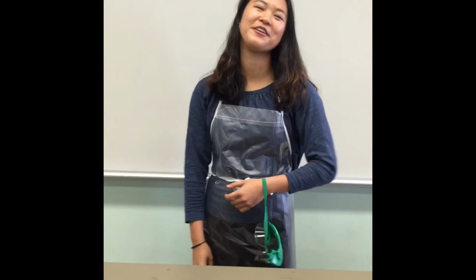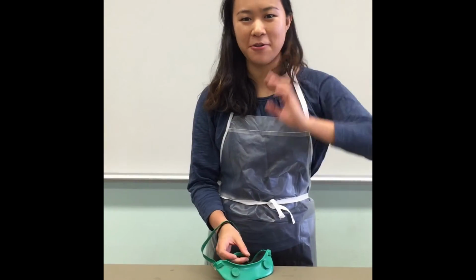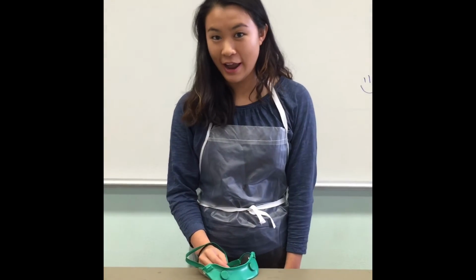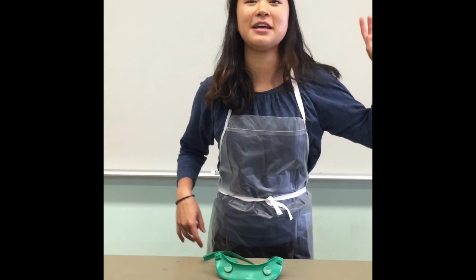Hey, Ermina, can you explain lab safety for us? Well, of course, lab safety is the most important element of any chemistry class, because there are a lot of chemicals that we deal with in accordance to the name chemistry, and they can be flammable and corrosive, and they can irritate your skin and hurt you. So what do we do to stay safe?